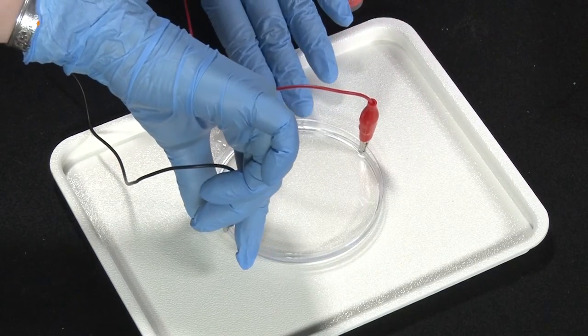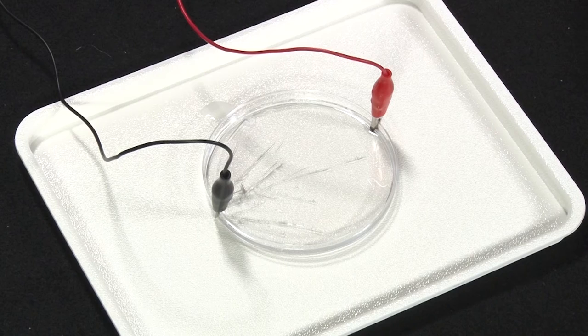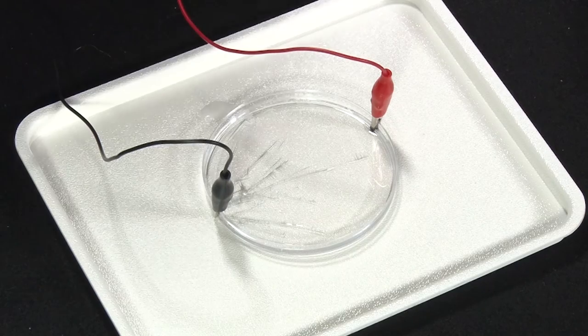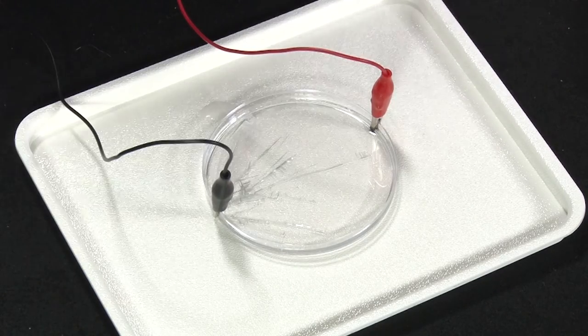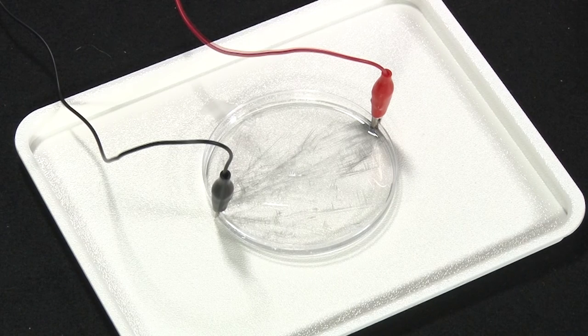And then we wait. Oh — I'm actually seeing something happening already! Holy cow, that is so awesome. And now you can actually see it spreading — the biggest structures are extending straight from one clip to the other, but you can also see a bunch of branching structures coming out from the sides too.